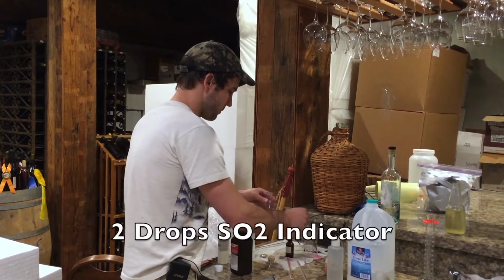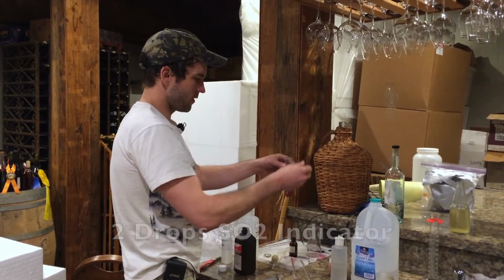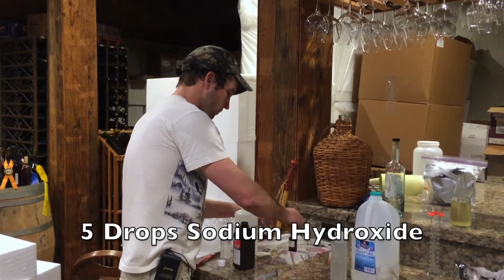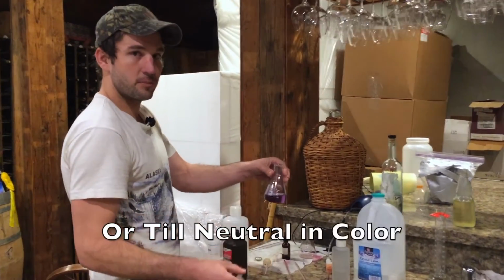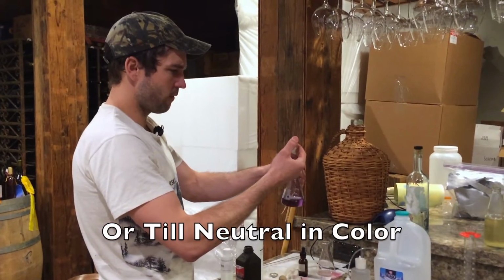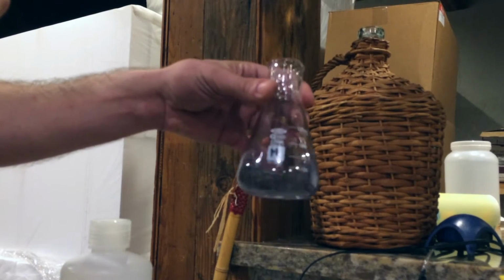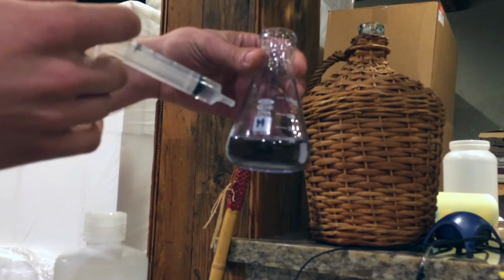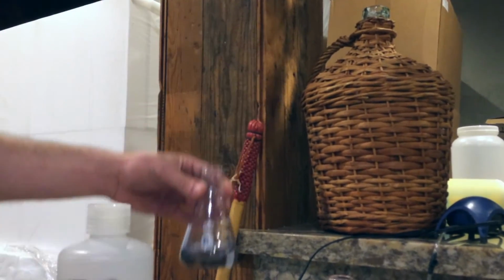Put in a couple drops of my SO2 indicator. This is something that changes color based on the pH of the solution. We're going to try to get it to the neutral point for this by adding some sodium hydroxide. Usually I just need about 4 or 5 drops. When it becomes this greenish grayish color, that's what you're looking for. So you want to keep it there. If I add one more drop, it's going to turn totally green. So you want it between the green and the purple, and that's going to be your base point.